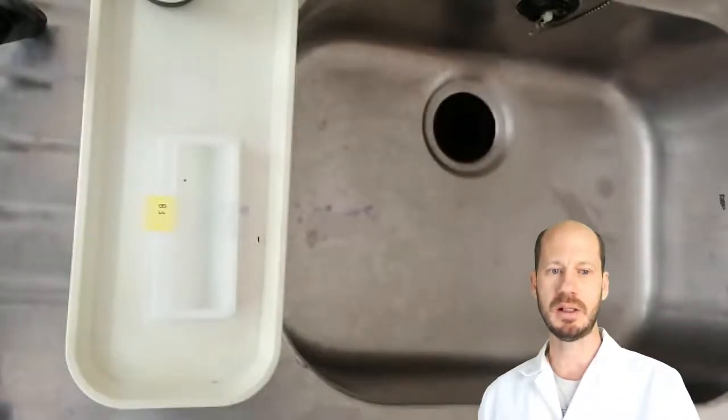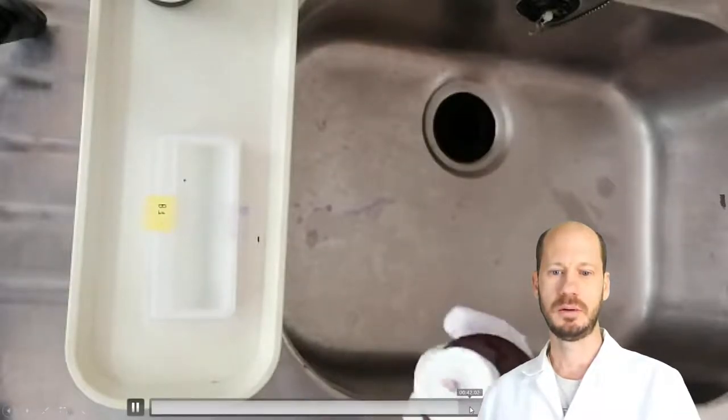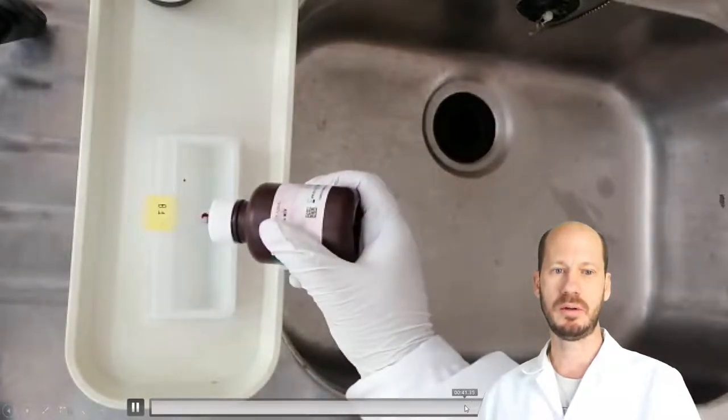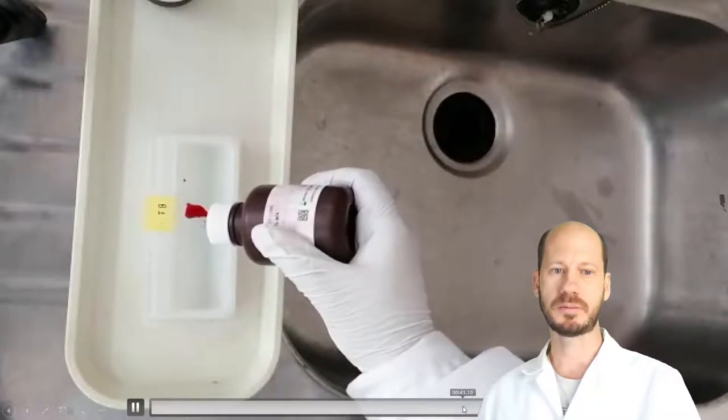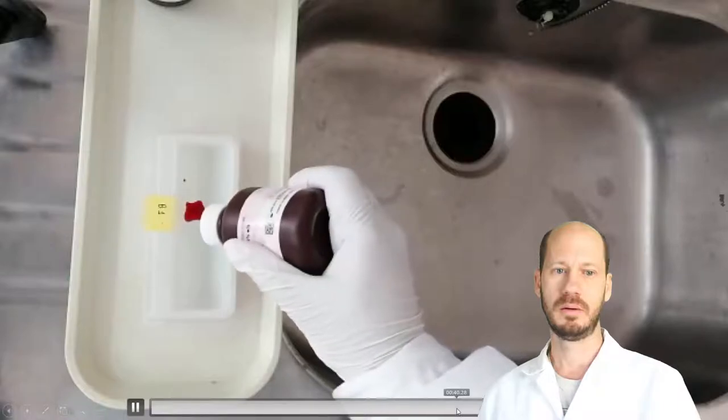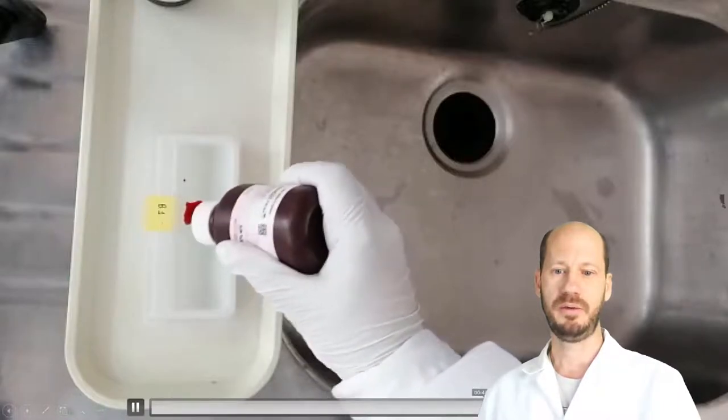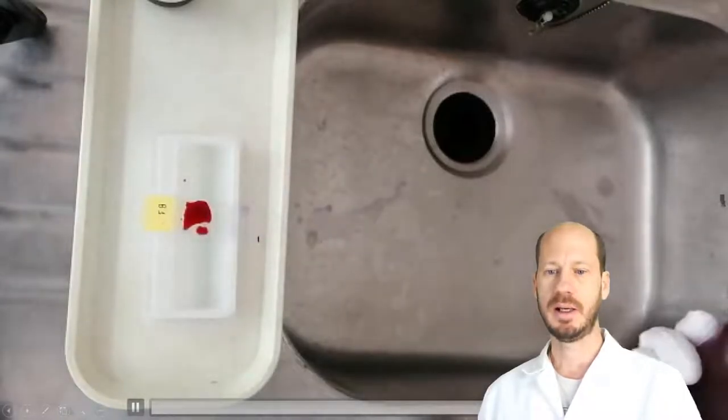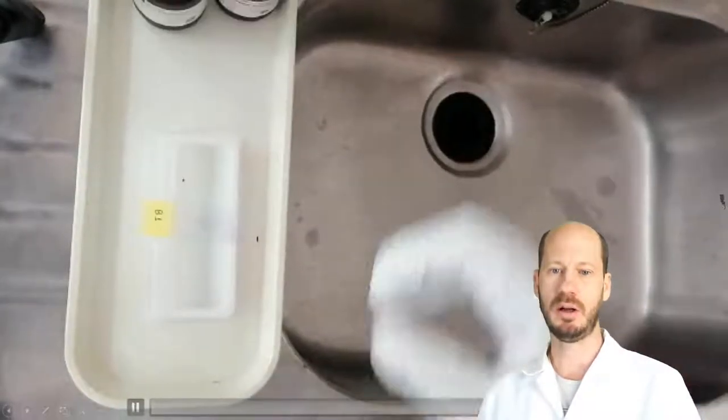The counter stain step is with safranine, which is shown now. A couple of drops of safranine over where the cells were. Leave it for a few minutes and then we can remove the safranine, the excess of safranine, and we can look at it on the microscope.